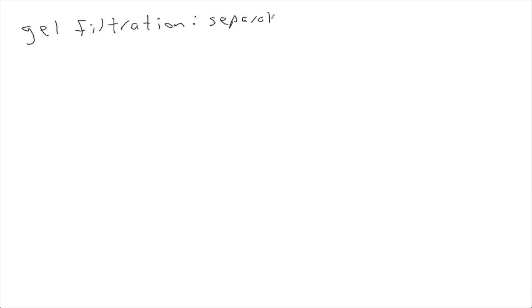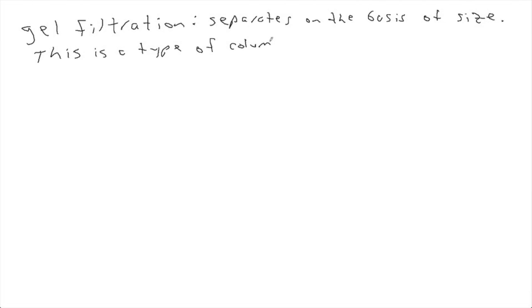And there's a special bead that has grooves in it that trap the smaller proteins, so the larger proteins flow to the bottom. Excellent. That's very good. There's really not that much to it. It's a really pretty simple idea. So that's right. One thing you haven't quite mentioned is that this is column chromatography. So the beads would be arranged on a column.